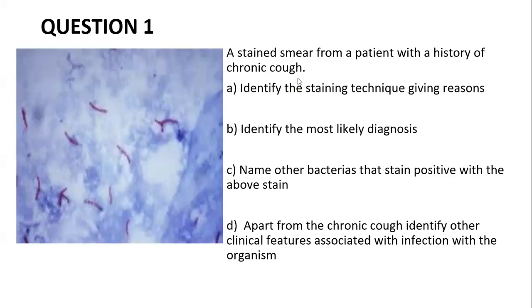Is it Ziehl-Neelsen staining? Ziehl-Neelsen staining, yeah. So if you know the answer, you can also type on the chat so that we move a little bit quicker since you were able to go through the paper. So this is Ziehl-Neelsen staining. If you're told to give reasons, you have to mention why you think it's a Ziehl-Neelsen staining.